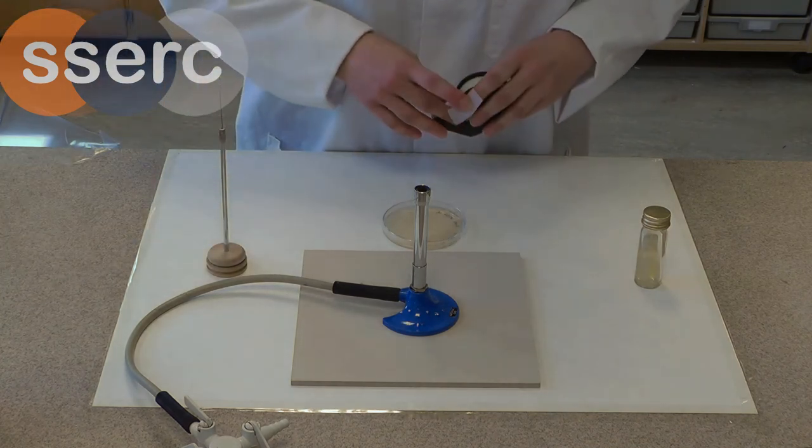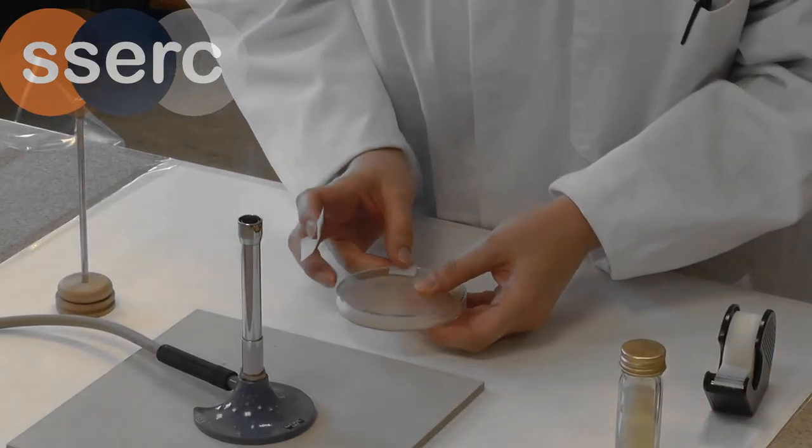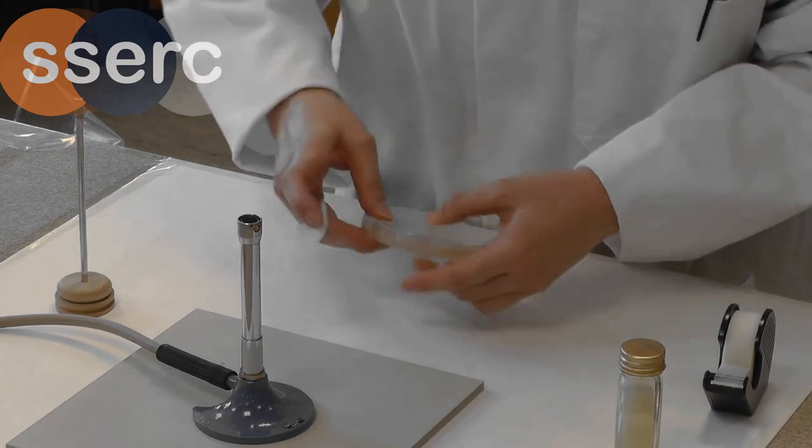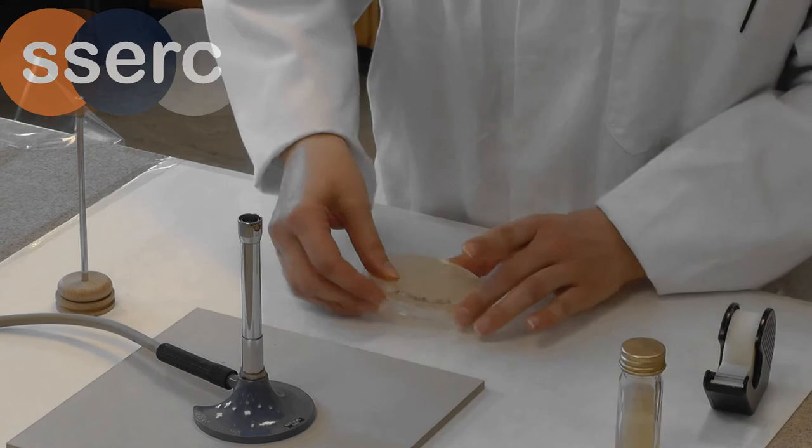The plate should then be sealed with two small pieces of tape opposite one another. Don't seal it all the way around, we don't want to create anaerobic conditions.